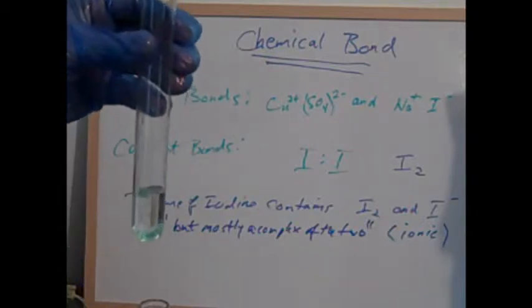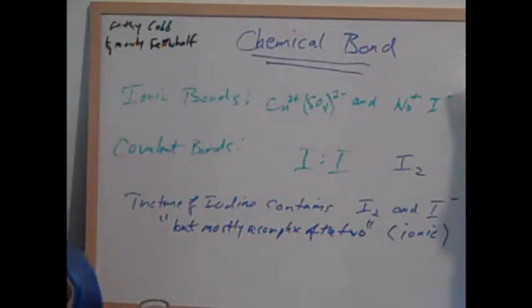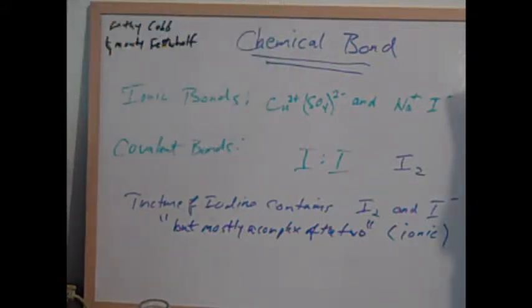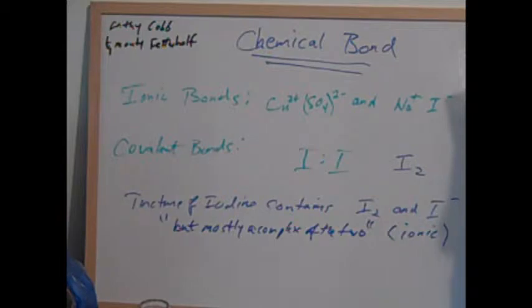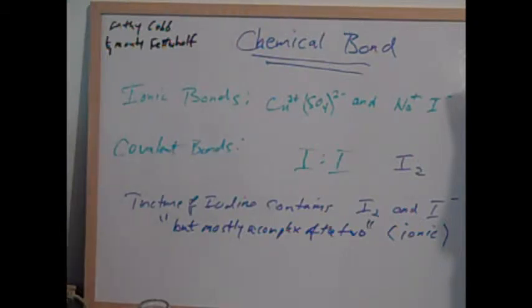The first step in this demonstration is to add some mineral oil and some copper sulfate solution to your 2-liter soda bottle. Again, we're using a test tube instead. We'll put in about equal amounts of copper sulfate, about 0.2 molar, and mineral oil in a test tube.